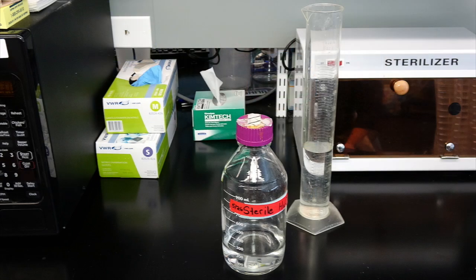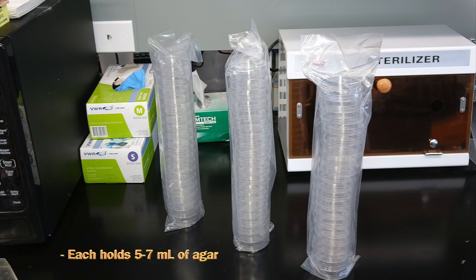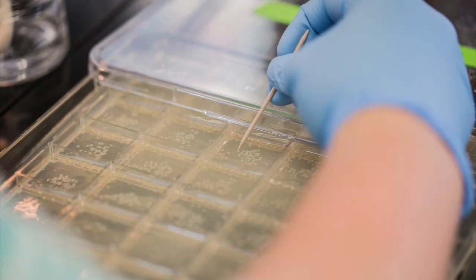Next, we have our sterile water. Our goal is to make 30 gels in 60 mm by 15 mm plates, each of which can hold roughly 5 to 7 ml of LB agar. On plates this size, you can easily distinguish about 100 individual colonies. If you're going to be doing high-volume screening, we recommend larger plates.